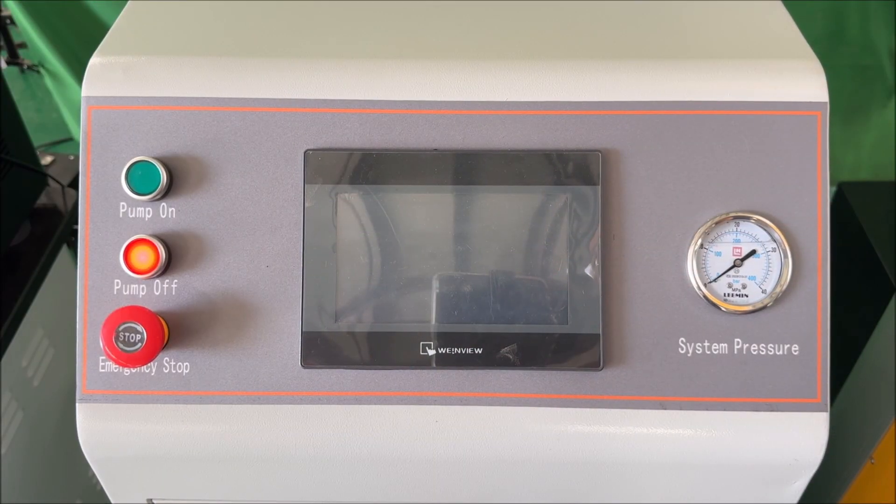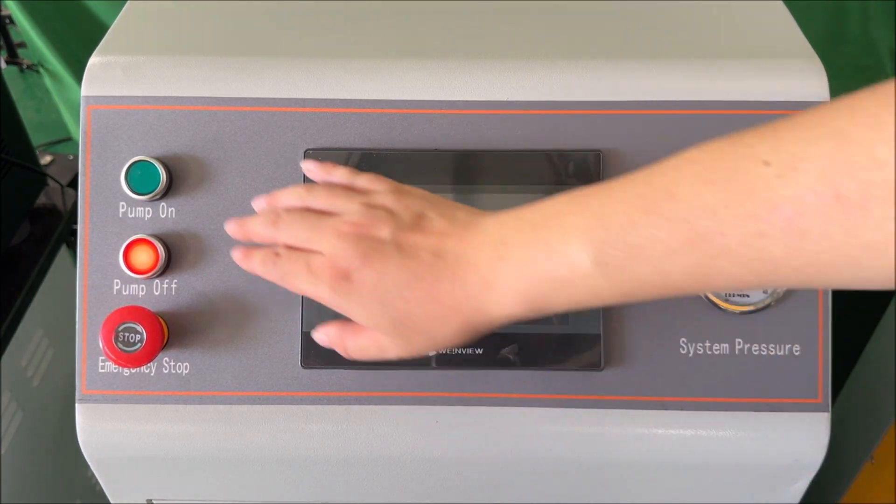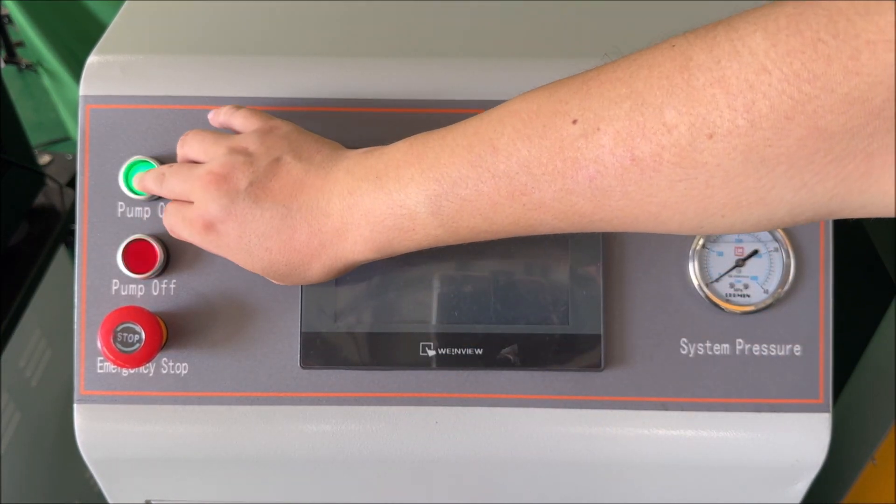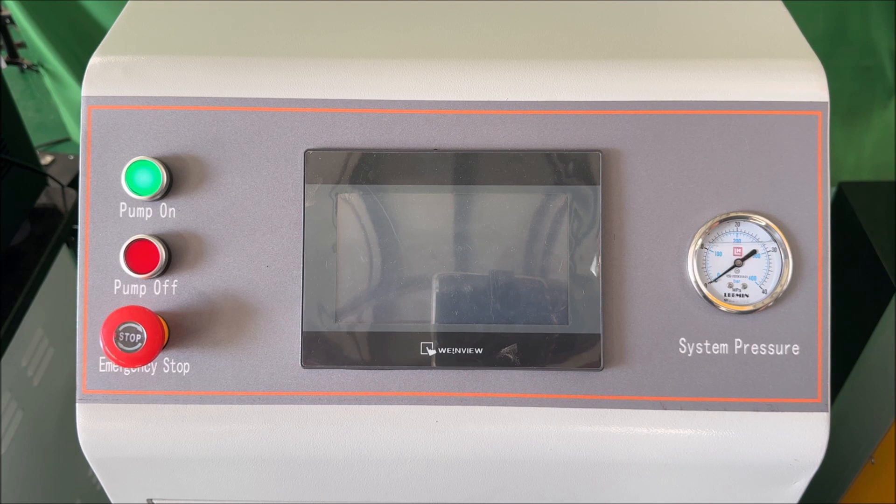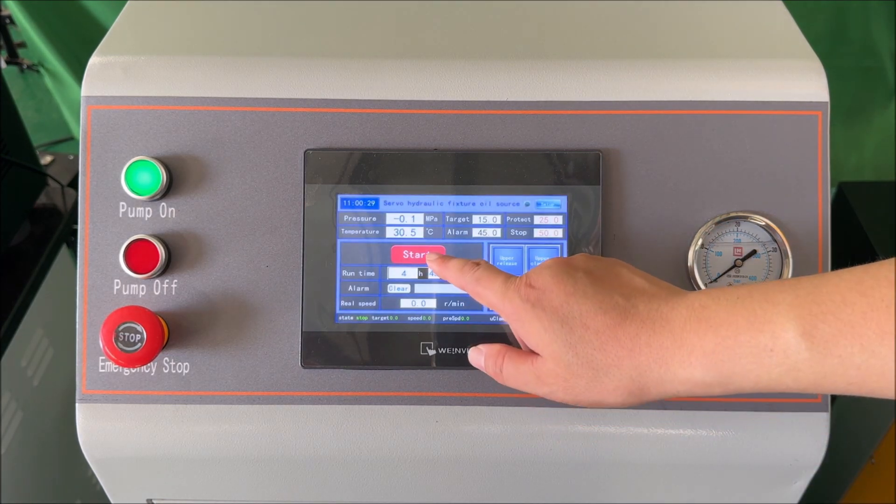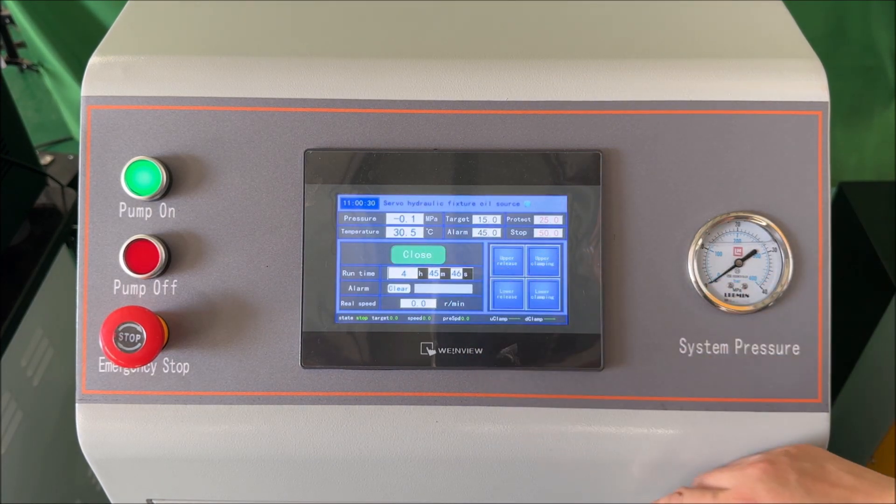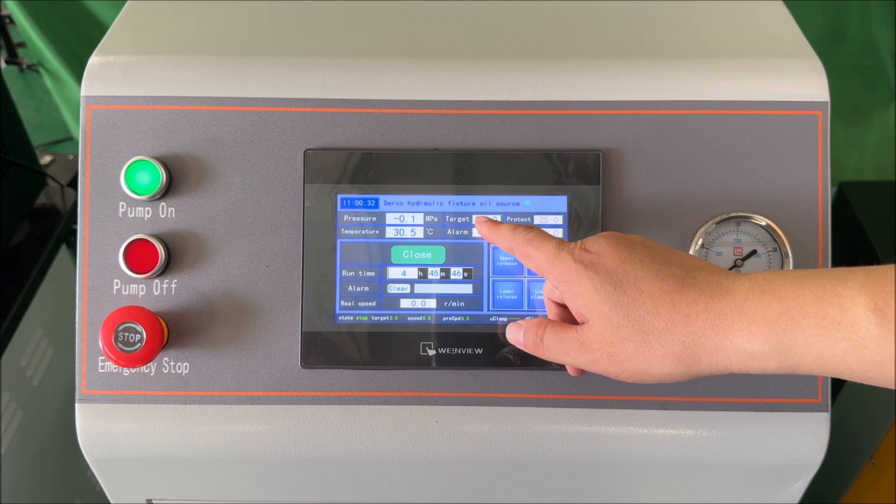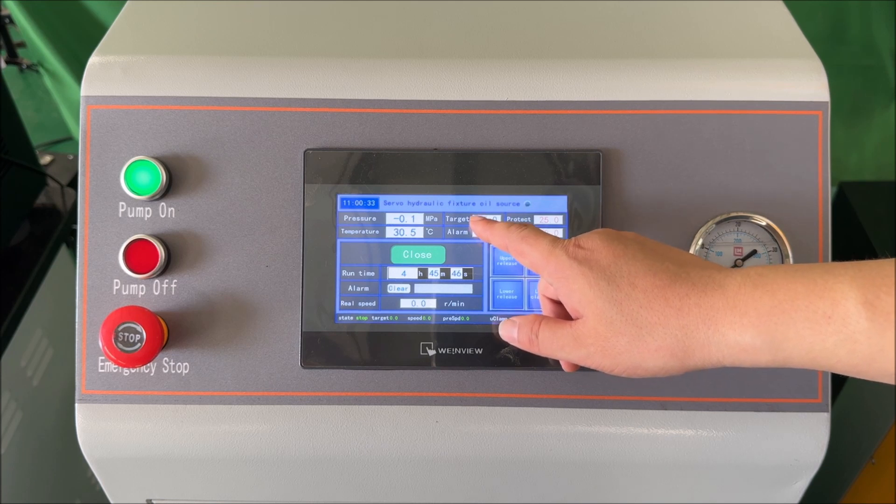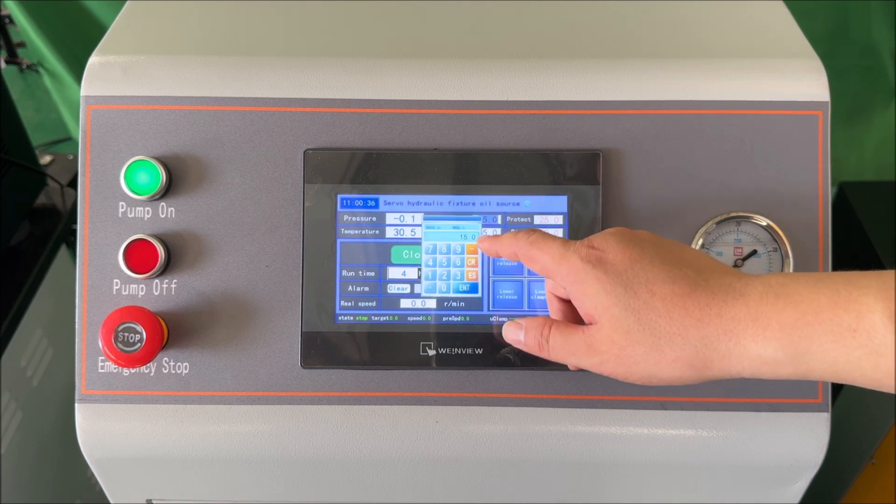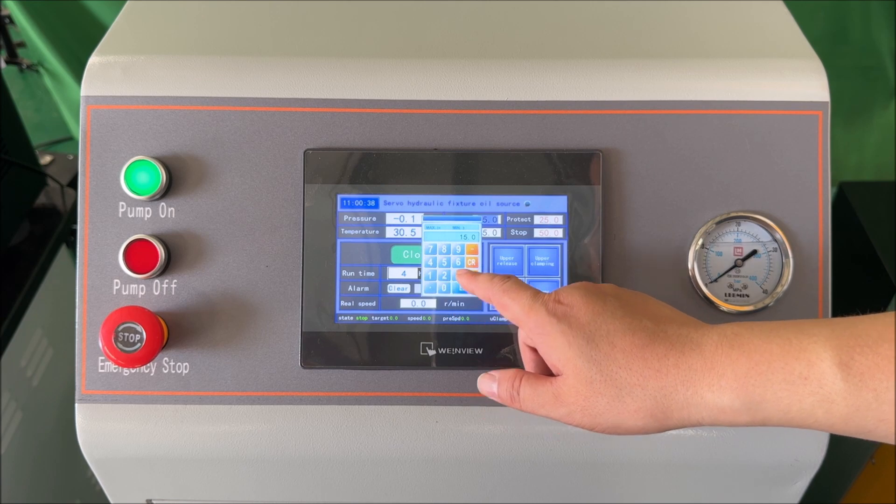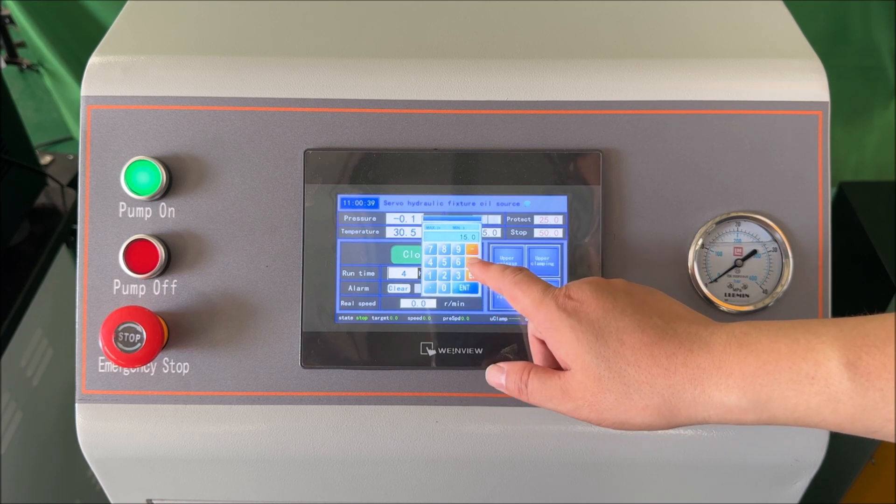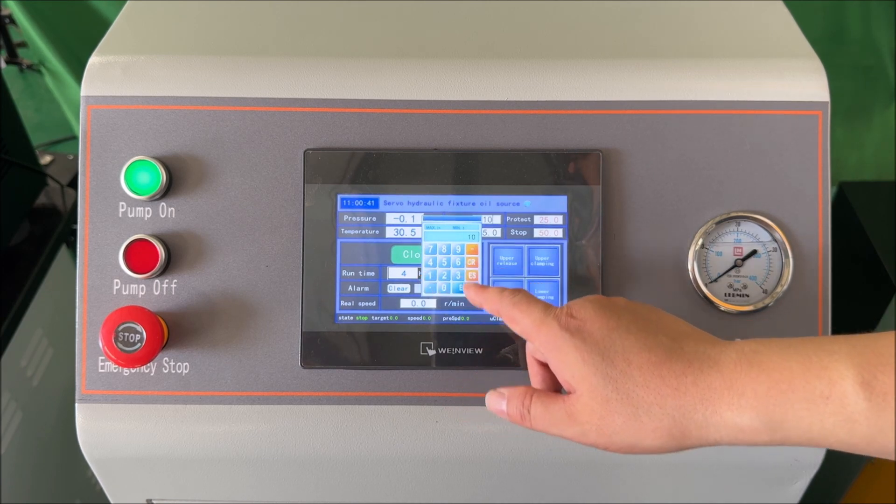This is the power pack. To start the operation, press pump on. Click start. You can preset the pressure target and the clamping pressure target by entering your preferred value. For example, 10 megapascals. Then click enter.